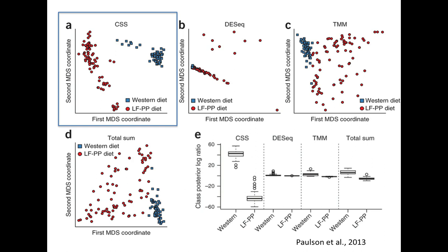So I'm going to shift gears a little bit from normalization, though there's been lots going back and forth about normalization, especially surrounding pseudo counts. My argument is, if you're going to include a pseudo count, I would recommend using 1. A pseudo count is where you take the count matrix and you add 1 to everything, followed by a log transformation.